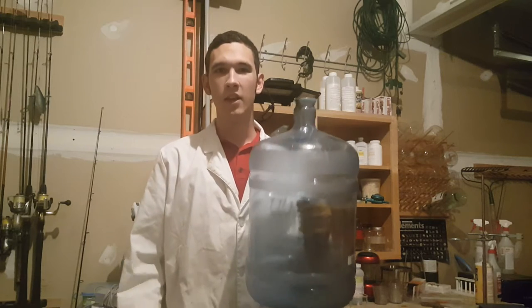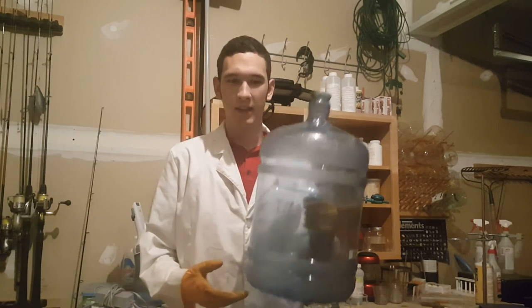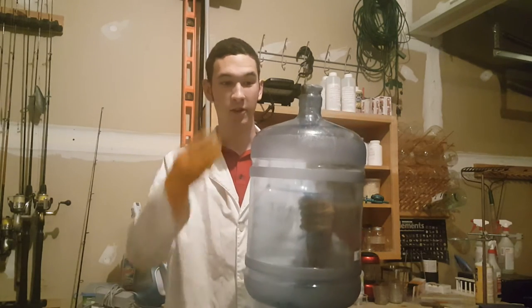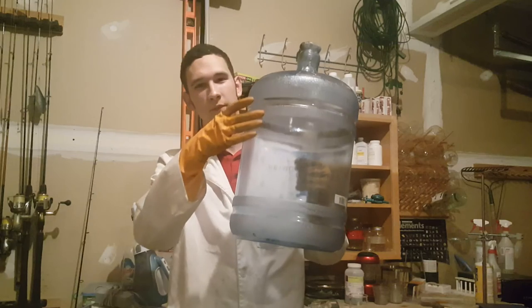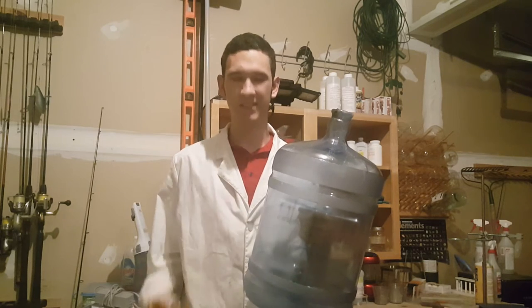Hi everyone, Frankiem here. Today I'm going to be showing you the Northern Lights in a Bottle. It's essentially just a whoosh bottle with a boron-based gas in it — to turn it green and slow down the combustion a bit, so you can watch a green flame travel down the bottle. If you watched my previous video, it did include this experiment, but my friends, family, and teachers seemed to really like this one, so I decided to break it off into a separate video, get some better footage, and explain it in a bit more detail. Let's get started.